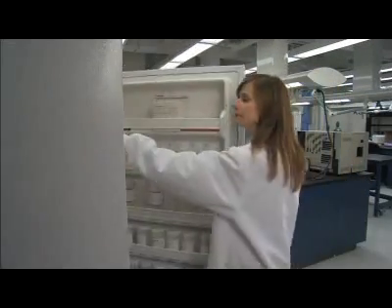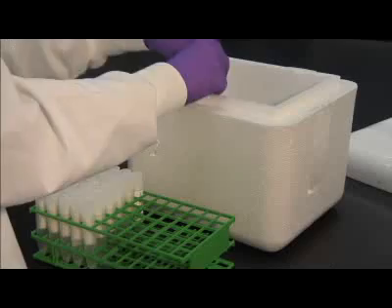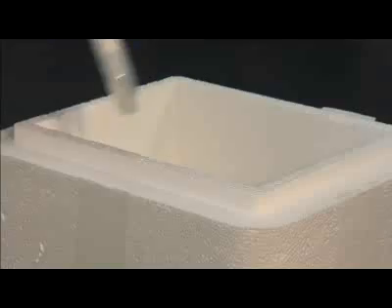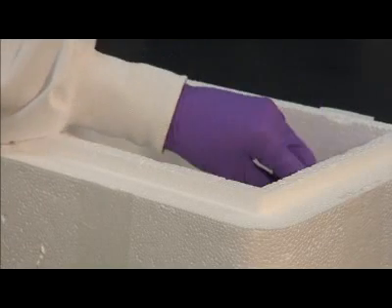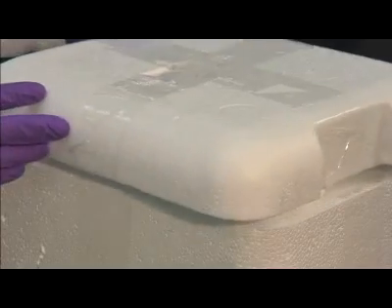Once all the samples have been collected, they will need to be shipped to the lab. Depending where your lab is, this may require special shipment. If the samples were placed in a -20°C freezer and are frozen, they should remain that way. Thus, you'll have to ship them with dry ice.